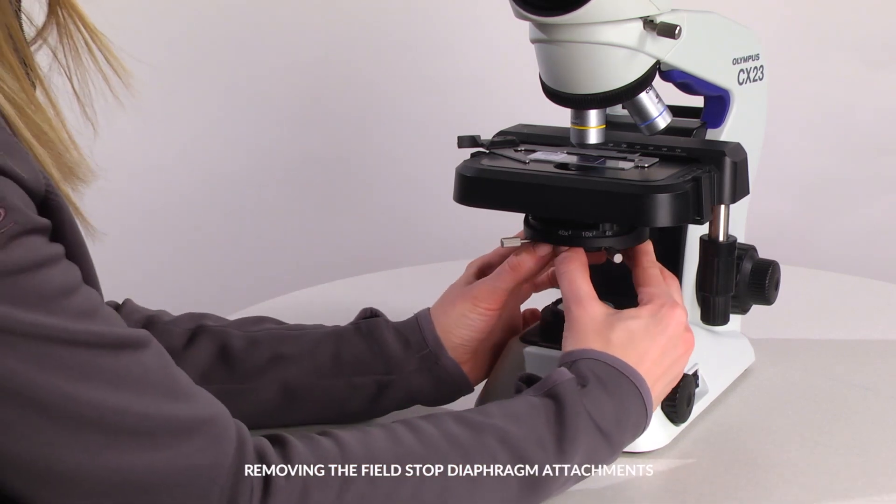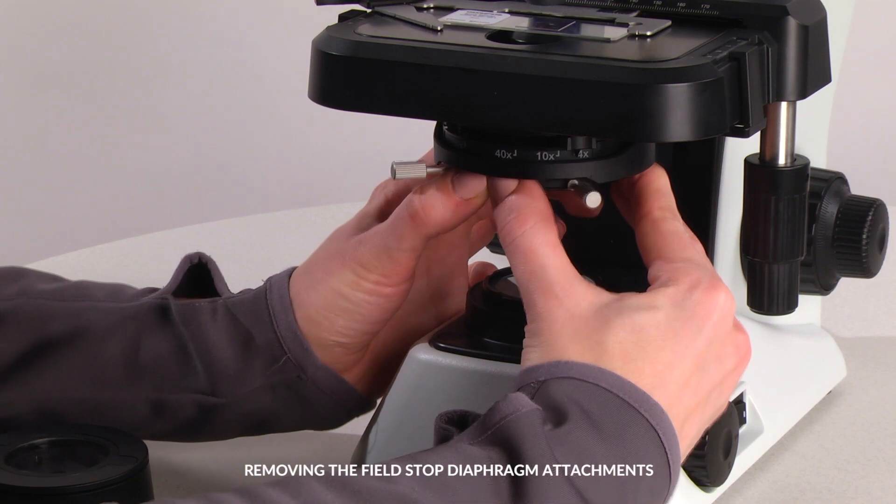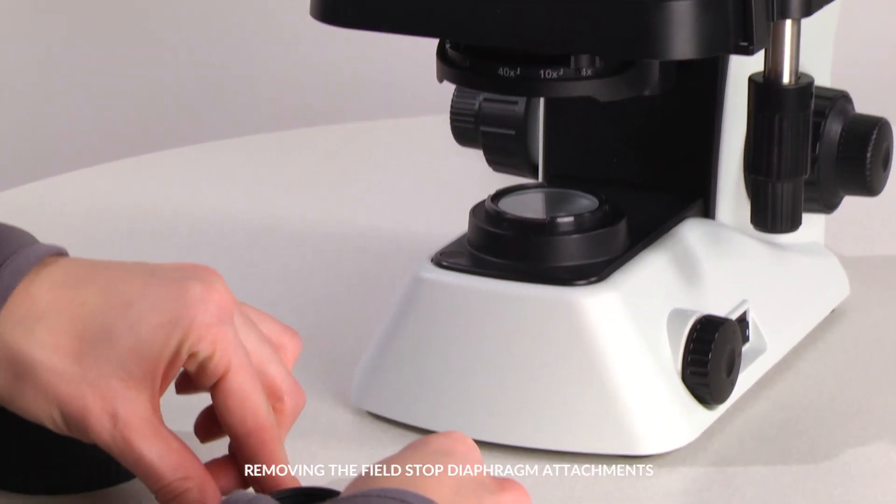To remove the auxiliary unit, gently push down while holding it. Do not press down too hard on the centering knobs as this may cause the auxiliary lens to shift position.